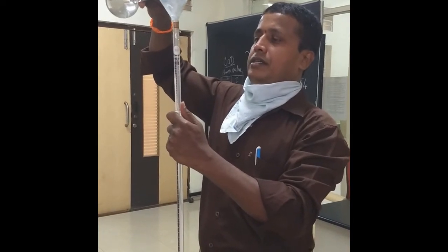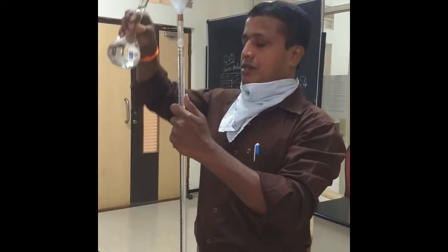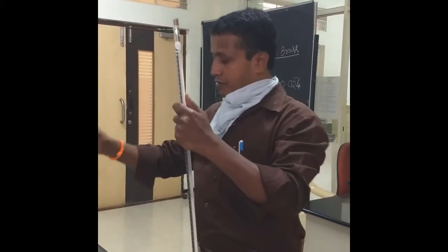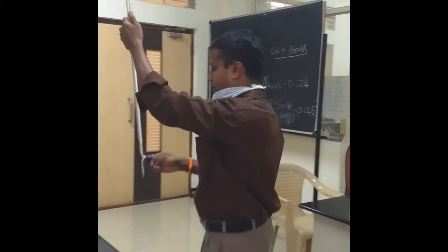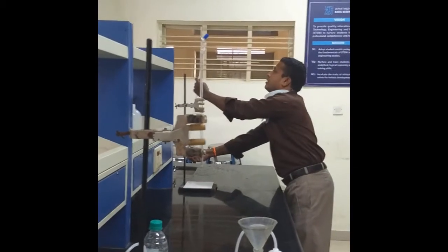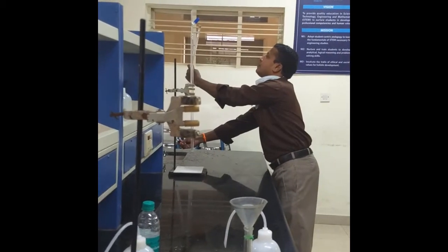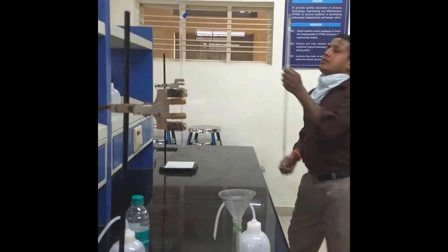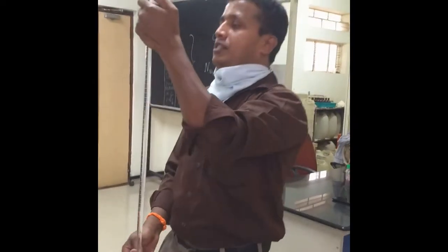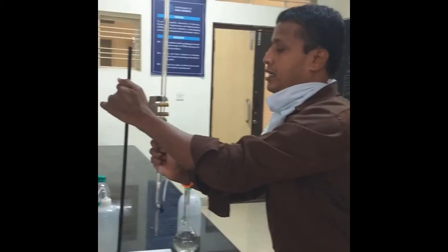Slowly, I have to add above zero because this nozzle portion is vacant and that needs to be filled. Adjust the reading to zero — the lower meniscus should coincide to touch this zero mark on the burette's graduation.